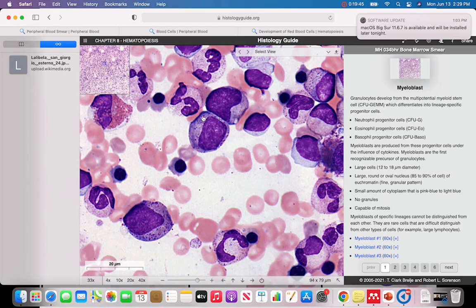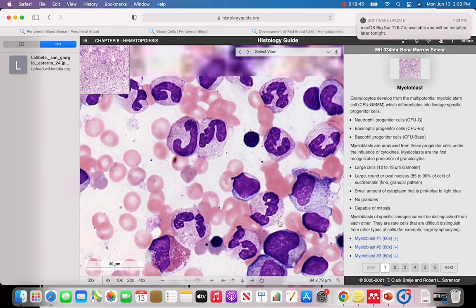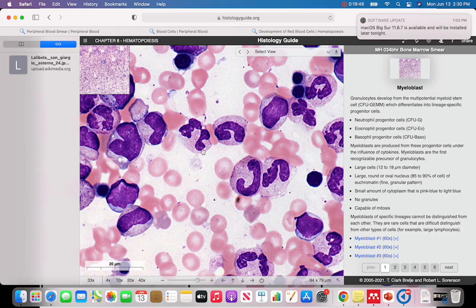As you see, this is a neutrophilic myelocyte. The nucleus is round and the granules are neutral. So this is a neutrophilic myelocyte. And when the nucleus begins to indent, it becomes a metamyelocyte. So this is a metamyelocyte. In the neutrophil development, we have an additional stage, which is the band form. This C-shaped nucleus, as you see, has equal width throughout its length. So this is the band form or band stage. And when this nucleus becomes lobulated or segmented, we will have a mature neutrophil.